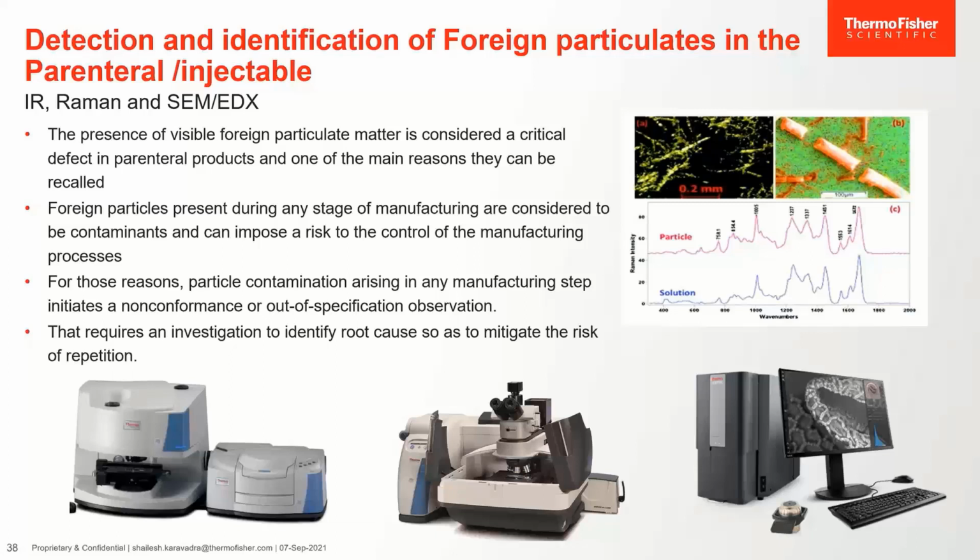SEM-EDS is a complementary technique to Raman or IR, which can classify particles, mostly metallic or inorganic, size 1 micron and greater, and it provides elemental composition of each particle. SEM-EDS can identify additives or impurities present at trace quantities that may not be IR active or are present in insufficient quantities to give IR information.